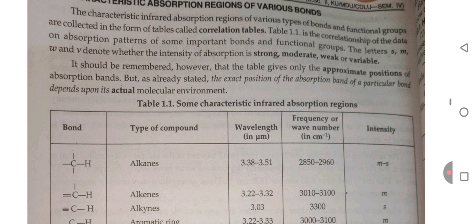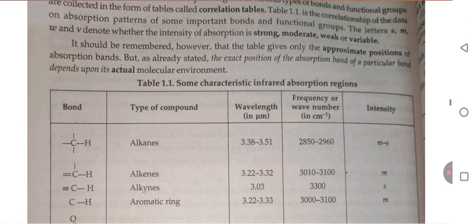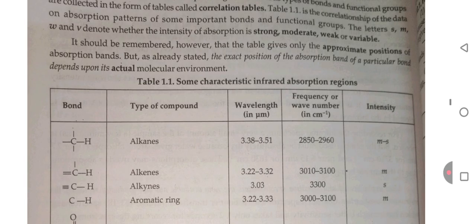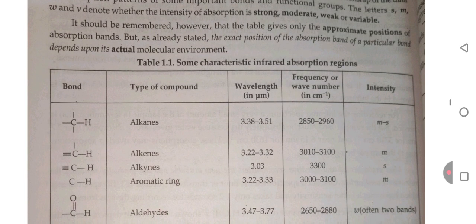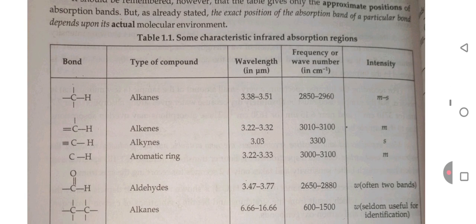It should be remembered, however, that the table gives only the approximate position of the absorption band. As already stated, the exact position of the absorption band of a particular bond depends upon its actual molecular environment.